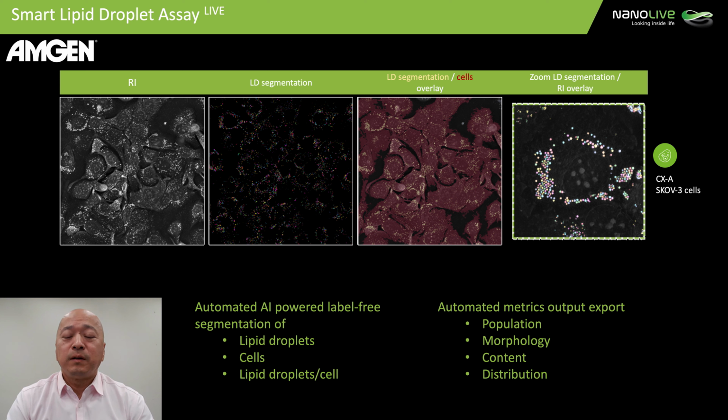Now, when it comes to lipid droplet, their characteristic refractive index allows the very clear and accurate segmentation of these lipid droplet particles from the remainder of the cells, as shown in this slide, which I reviewed as the perfect first application for us. I was very excited to try it, as we have many investigators with a need to study lipid droplet in a variety of cells.